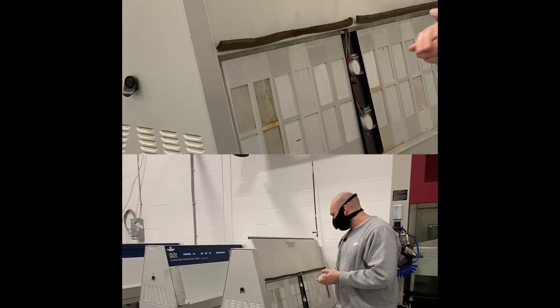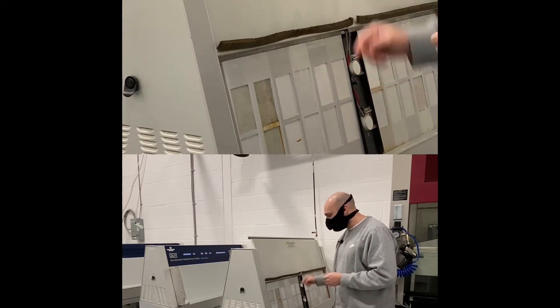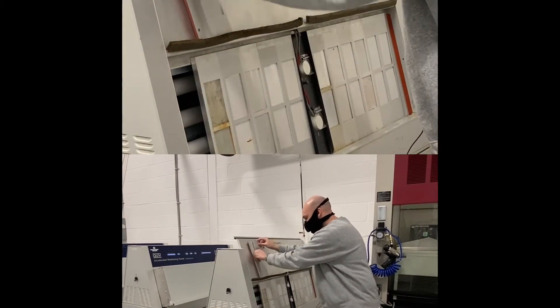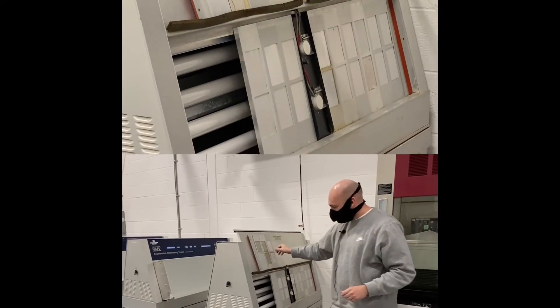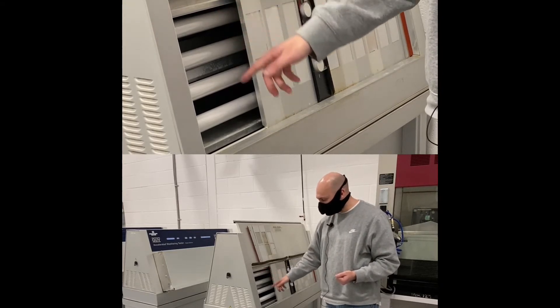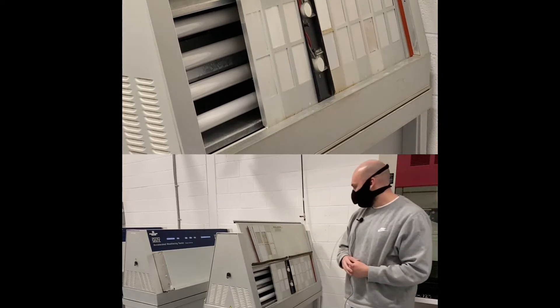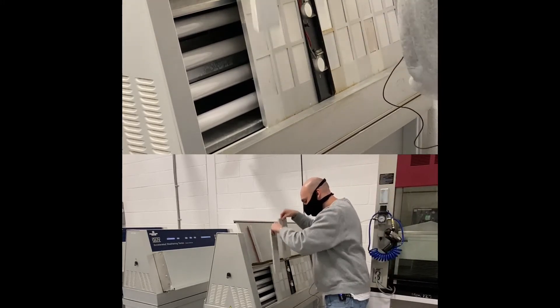In this chamber, we have four sensors — two on this side, two on the other side. We also have four UVA 340 lamps on this side and four on the other side. I'm going to show you how the calibration works.